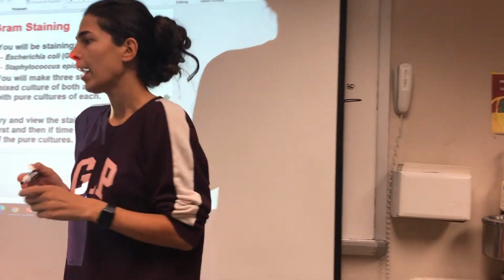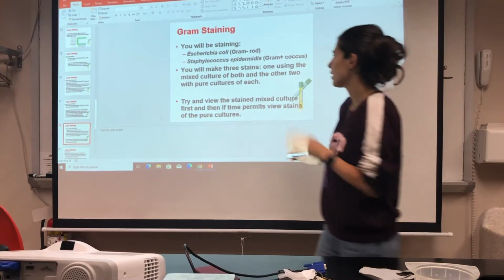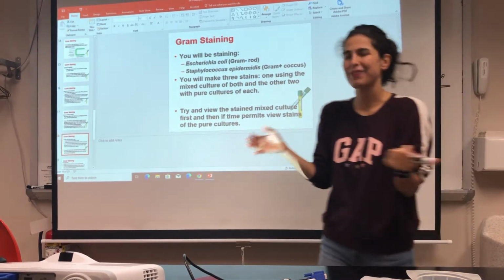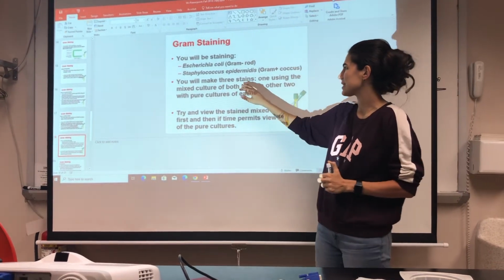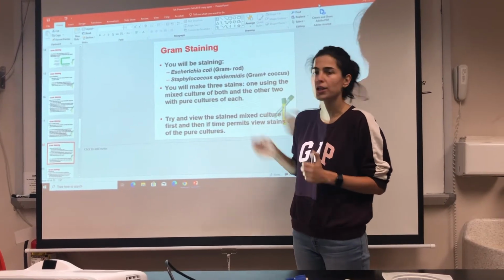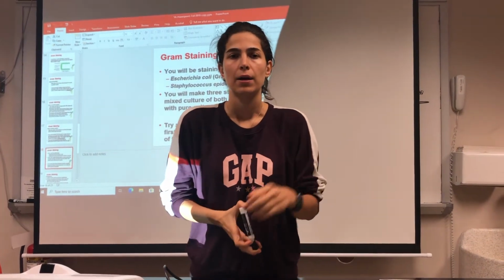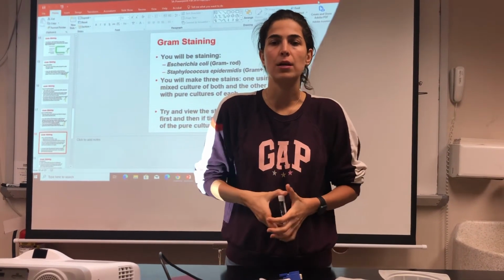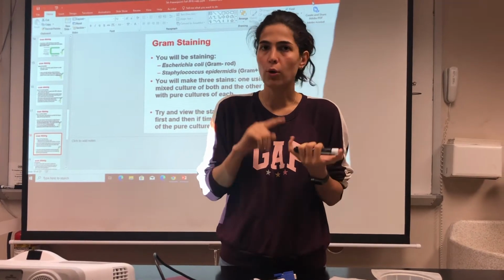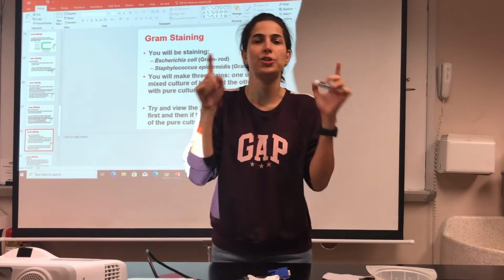Okay? If you have a class, you will make 3 stains, one using the mixed culture and the other 2 with pure culture of each. But for today, we just make the mixed culture because you can see E. coli and Staphylococcus epidermidis in one shot, okay?